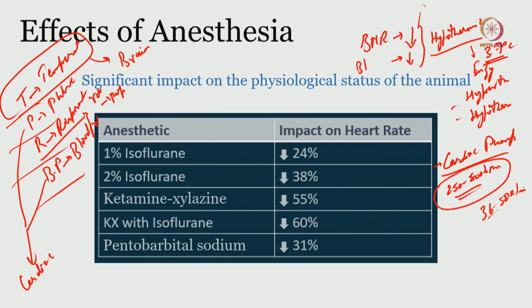So, these are very important numbers to remember, and there are many systems which will automatically display these parameters, and not only display them, they will also raise an alarm if the threshold has been set manually within their systems. All right. So, the cardiac pump is very important to maintain the blood pressure, which will maintain the cerebral perfusion pressure.